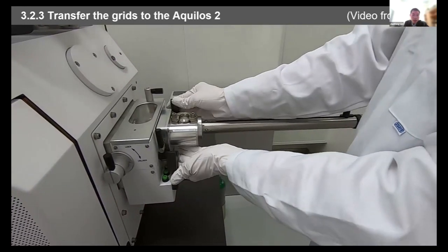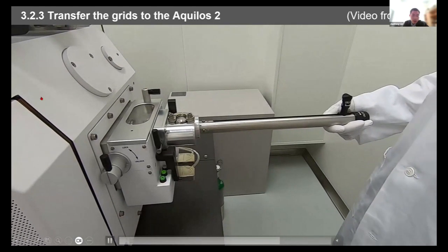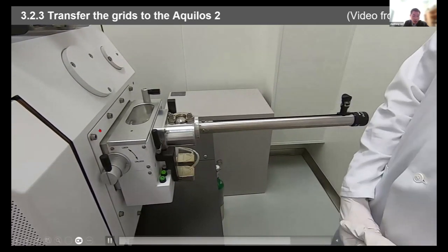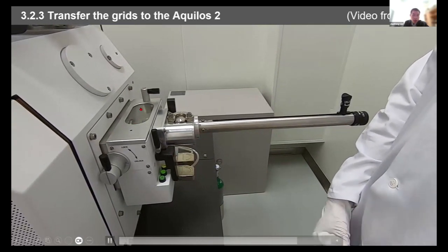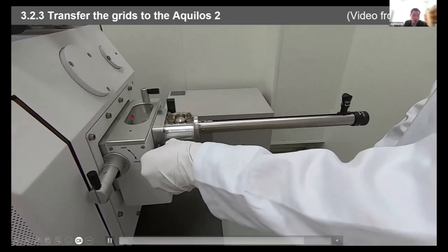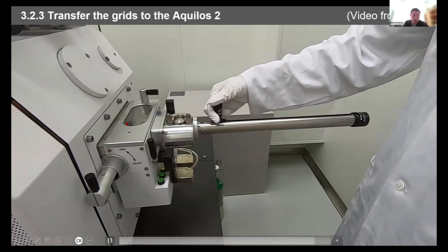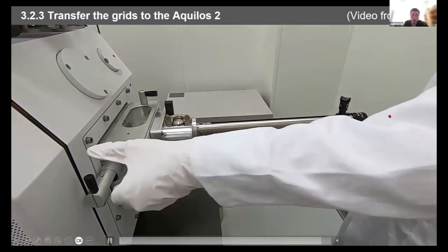And you lock it, secure the transfer rod. After you press the P, the system will move the sample stage to the location where it's ready for you to transfer the sample. And then here, the airlock will be pumped. Once the vacuum is ready, you will hear a sound, and then you open the valve and transfer the sample into the chamber, release the sample and transfer the transfer rod back.